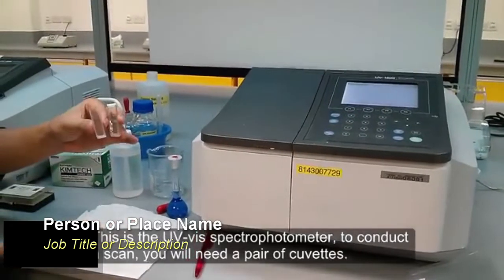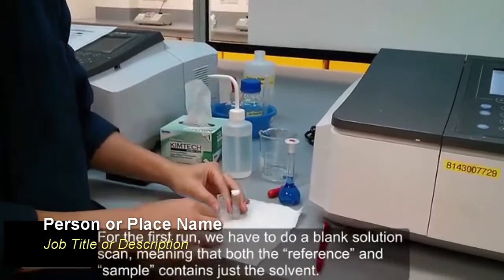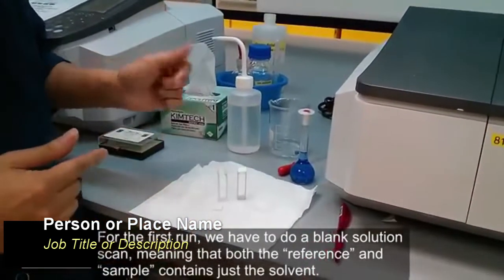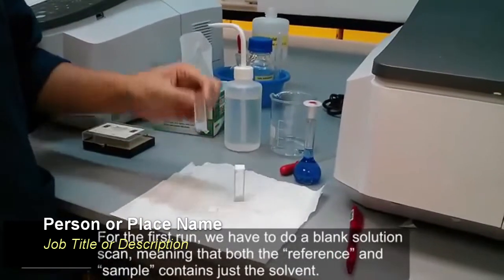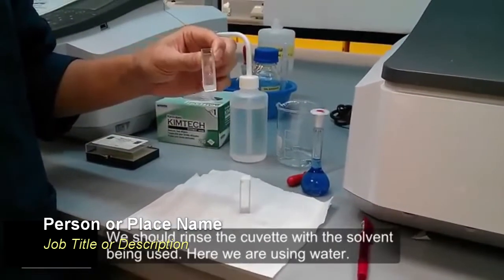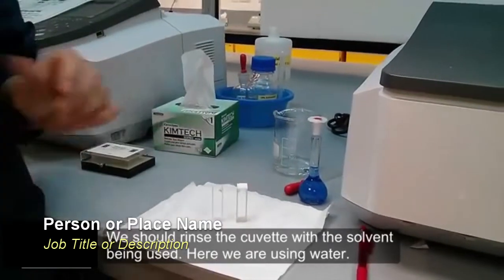To conduct a scan, you will need a pair of cuvettes. For the first run, we have to do a blank solution scan and auto-zeroing, meaning that both the reference and the sample contain just the solvent. We should rinse the cuvettes with the solvent being used. Here we are using water.